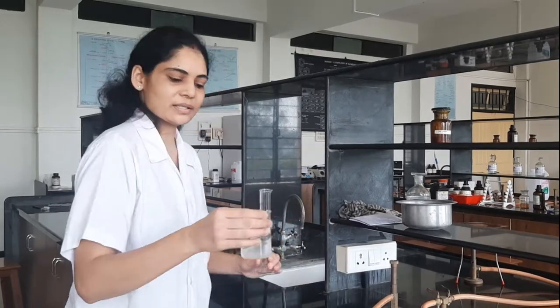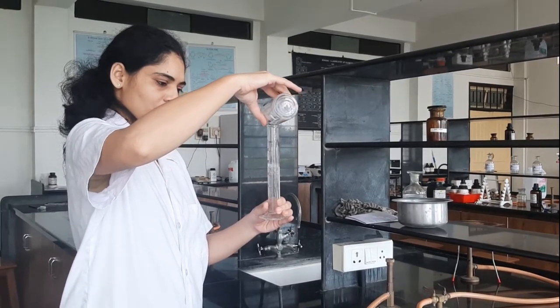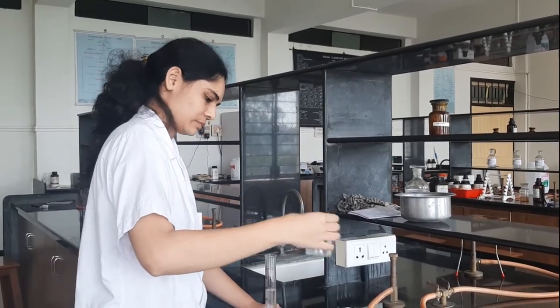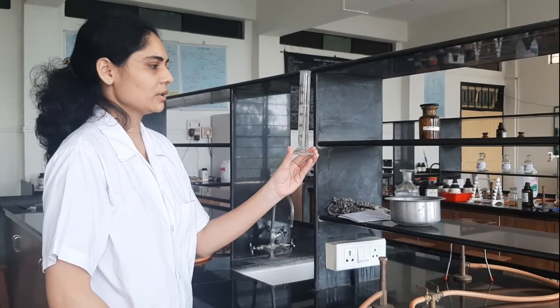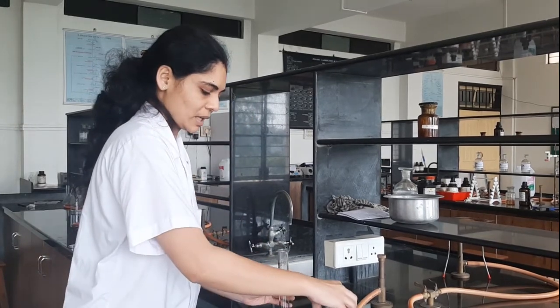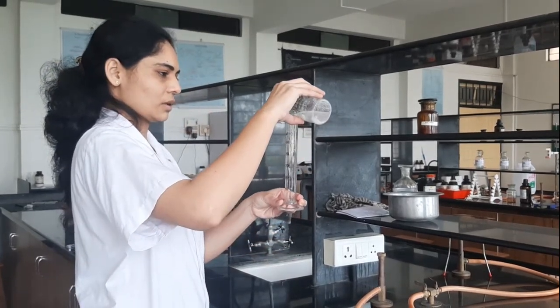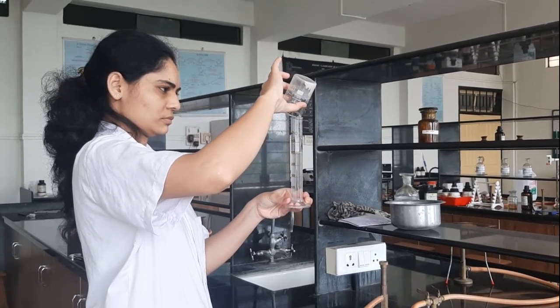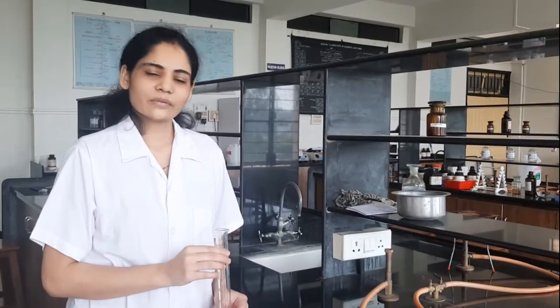Now this is our 20% NaCl solution. We will measure its volume. So it is almost 39.5 ml. The 20% solution is remaining as 39.5 ml, and this last is our 30% solution. The remaining amount is 41 ml. Now we will proceed with the last part.